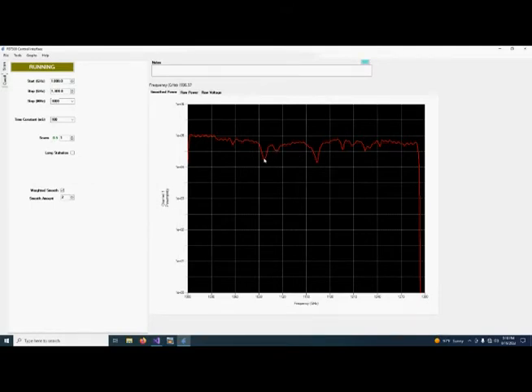Okay, after we let this complete, I'll show you another neat aspect of the second harmonic detection.